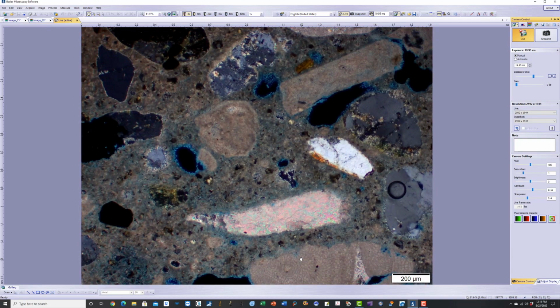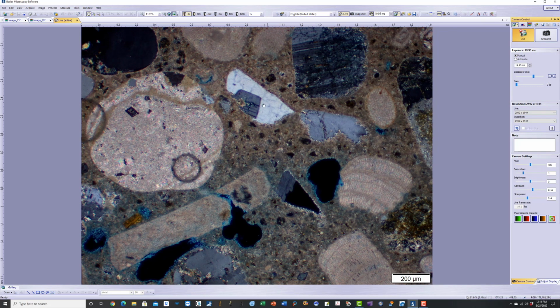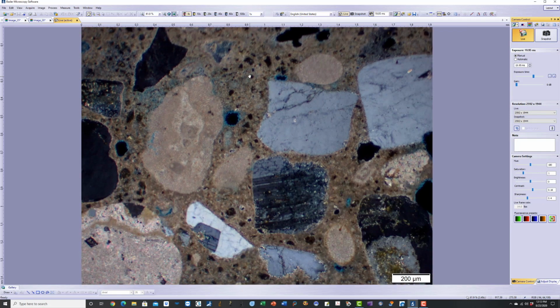As I'm going up towards the surface region of this mortar coating, you see more and more carbonation. Then this is kind of the boundary between the dense paste and less dense paste. The dense paste is severely, thoroughly carbonated. And this is the exposed surface region of the mortar coating before the paint layers were applied.